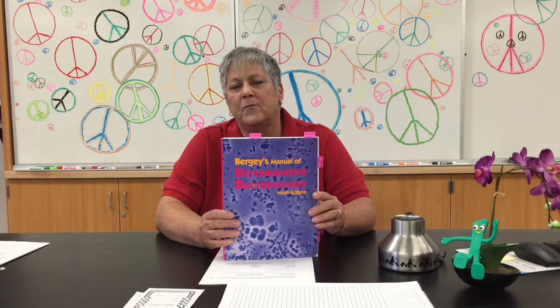And then you will gather up your things and you'll head off to the library and you will check out a copy of Bergey's manual. Now, here's what it looks like. This is Bergey's Manual of Determinative Bacteriology, 9th edition. And we've got several copies of this book on reserve in the library.